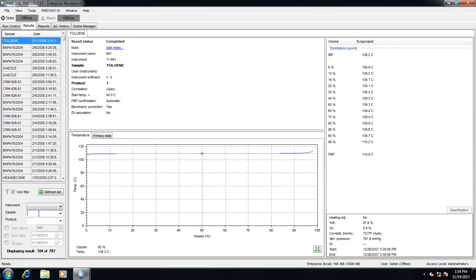If we wish to filter these results by a specific sample type, simply use the provided drop-down box by selecting the sample type or type in that sample type. You'll notice that Iris recognizes the characters we've typed and eliminates any data that does not match our criteria.